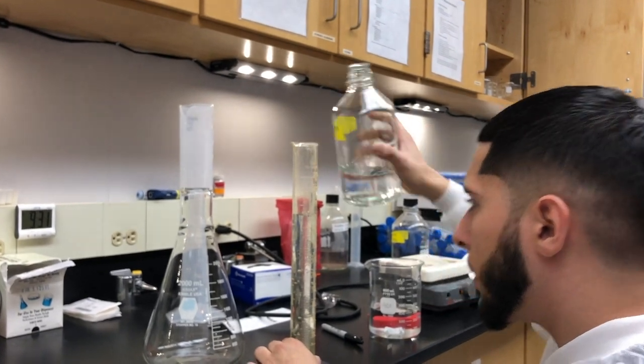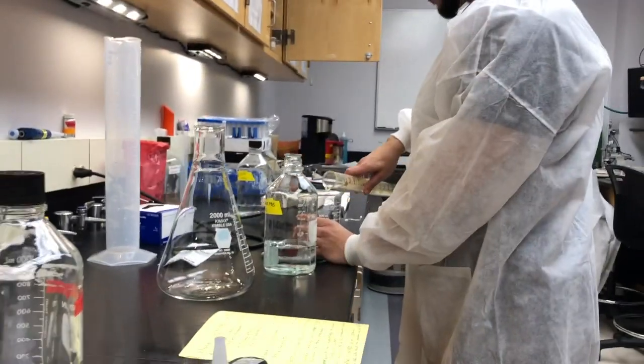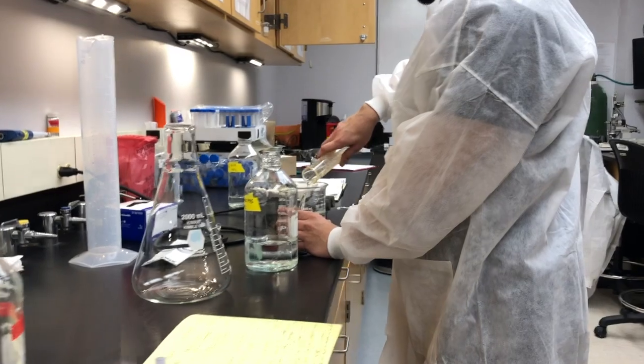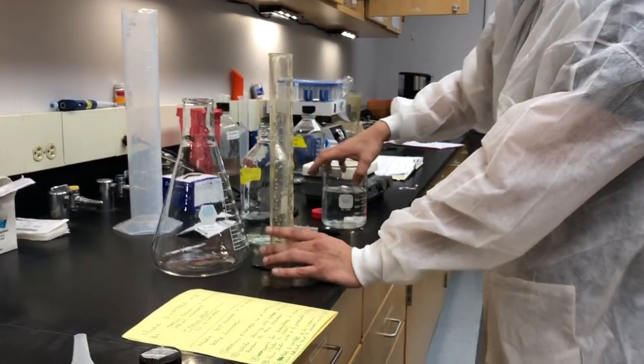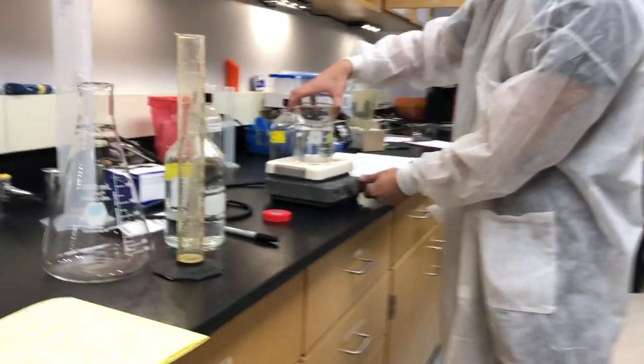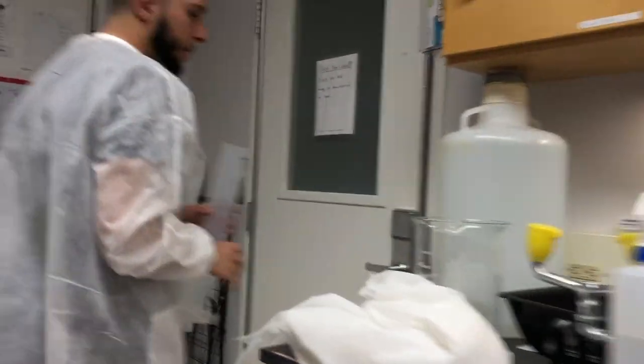We're going to let it mix a bit while we go and get our deionized H2O. So now we're going to get the bigger graduated cylinder and get 500 milliliters of deionized water.